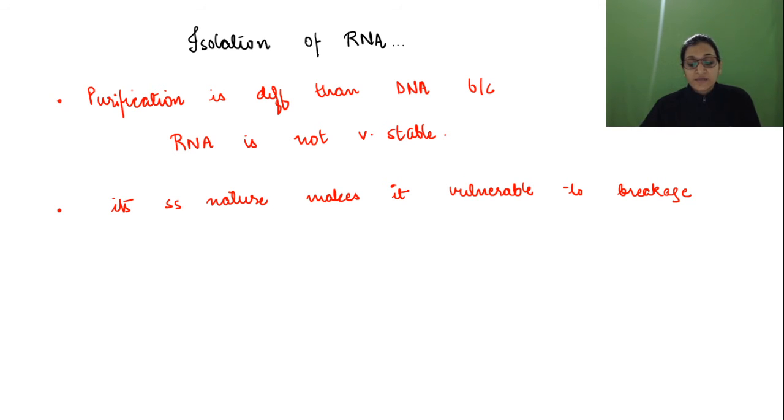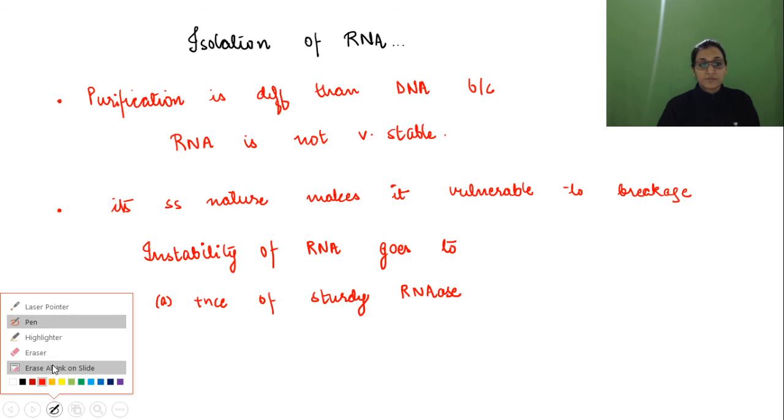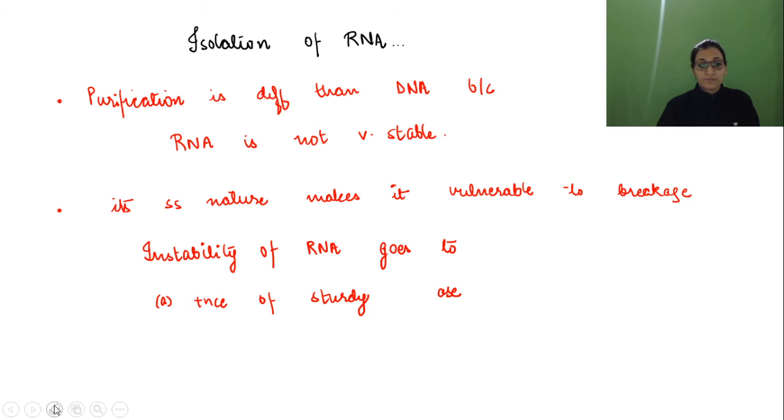First is the presence of RNases, sturdy RNases. These are very stable enzymes and cannot be easily inactivated.